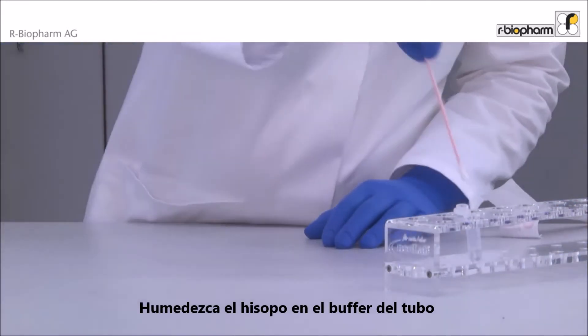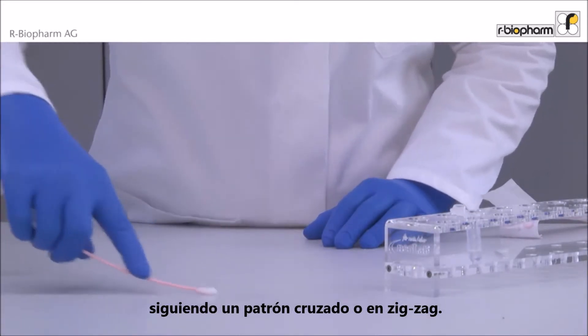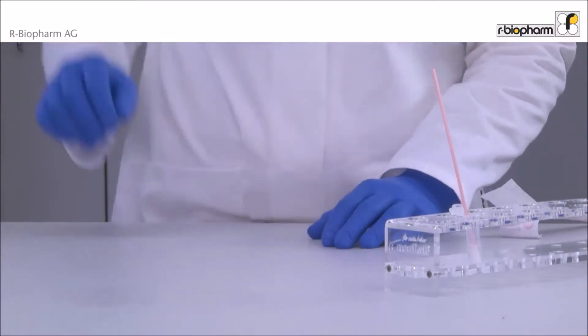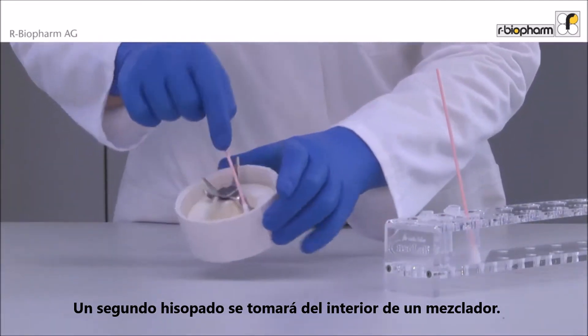The swab is dipped into the buffer vial, then swab the surface while rotating the swab head in a crosshatch or zigzag pattern. A second swab is taken from the inside of a blender.